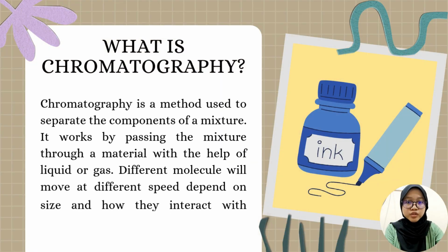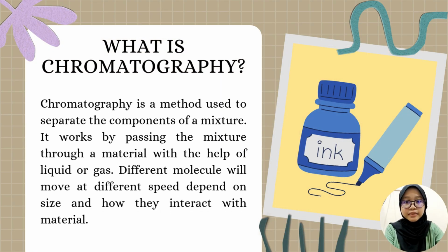Chromatography is a method used to separate the components of a mixture. It works by passing the mixture through a material with the help of liquid or gas. Different molecules move at different speeds depending on their size and how they interact with the material.